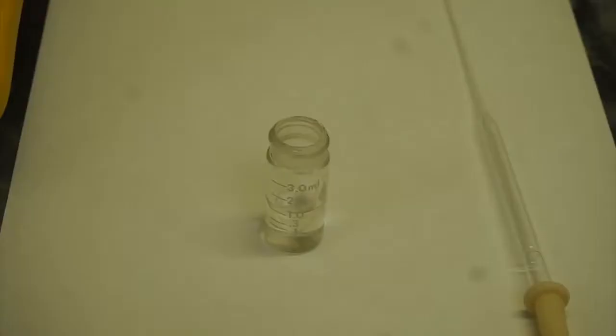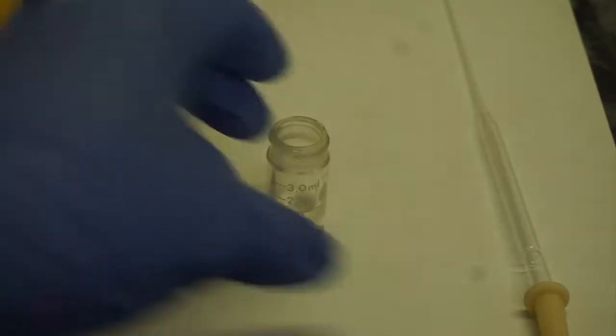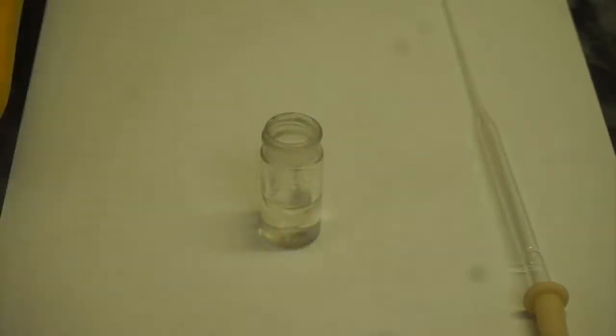After collecting all condensates in the 3 milliliter conical vial, as you can see, there are two layers formed. In this mixture product, there are water, unreacted 1-butanol, and N-butyl bromide, which is our target product.